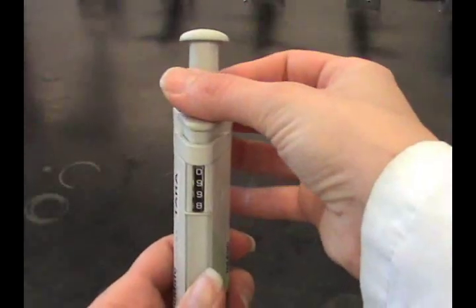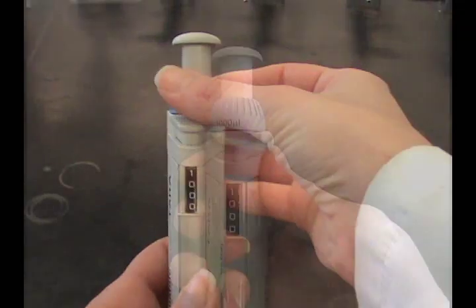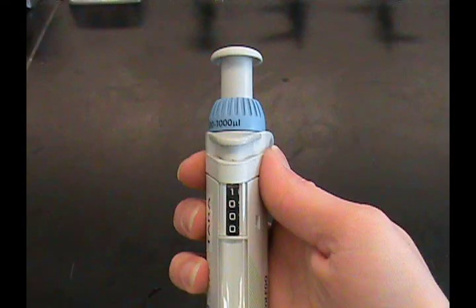To set the volume to transfer, twist the adjustment knob near the top of the pipette. Make sure that the required volume is read on the digital indicator on the side.